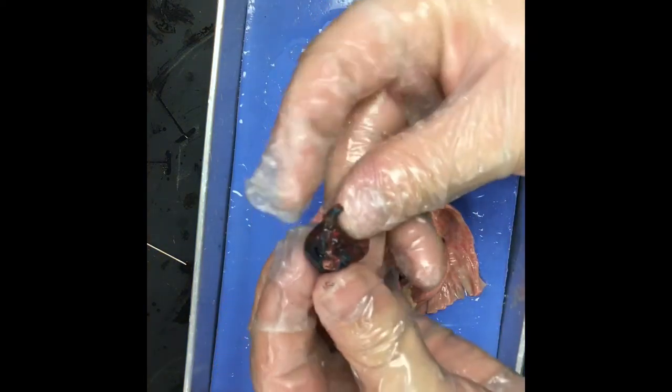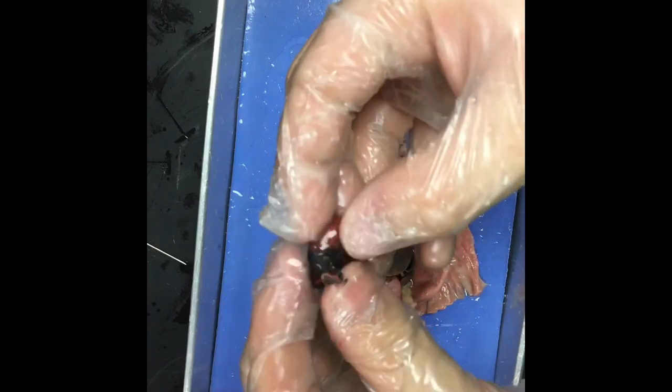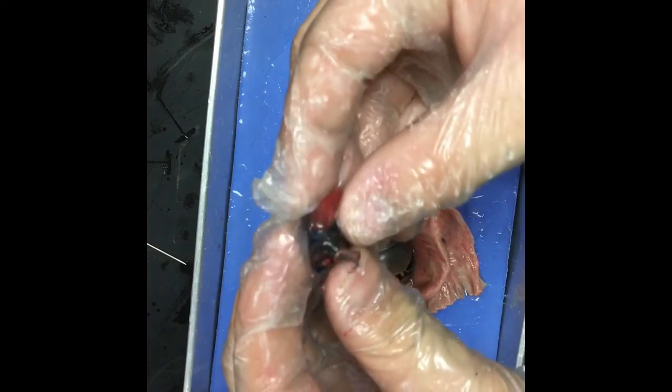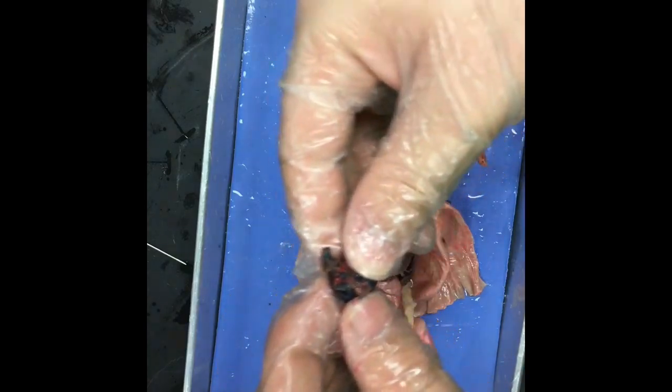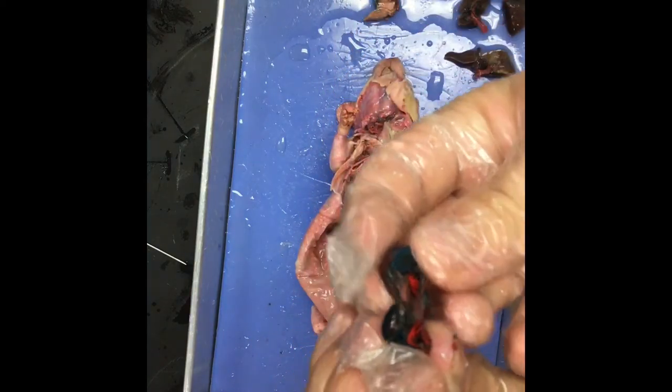Alright, let's see if this will work. It may not. If you squeeze it just right, you'll see coming out of the arteries, the aorta out of the top, you'll see a little bit of water pump out. But yeah, so you can take it apart entirely and see the different parts.